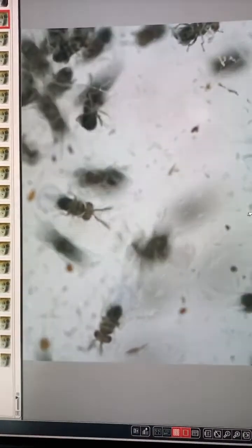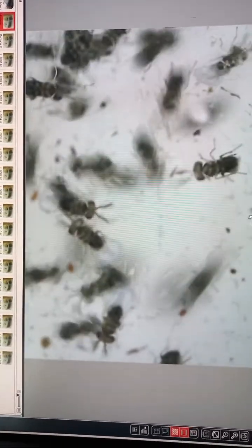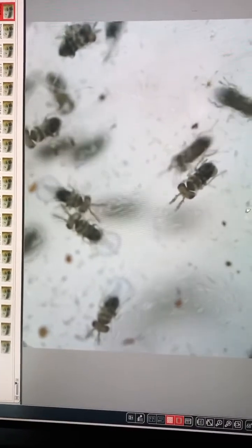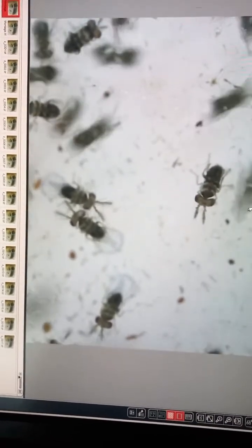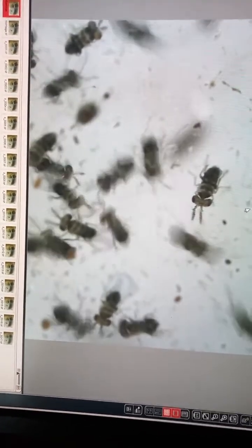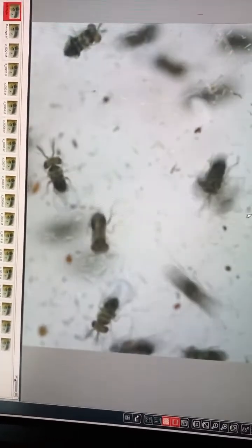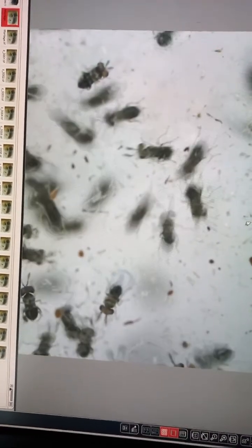So, but for that I can use another different microscope. This microscope is just for sorting, and this microscope is used for detailed pictures of big insects. Big insects, it means insects of a size about 1 millimeter. And not for video. This is just my invention. Try to take some video for educational purpose. Because not everybody has seen Trichogramma online and Trichogramma under the big magnification.